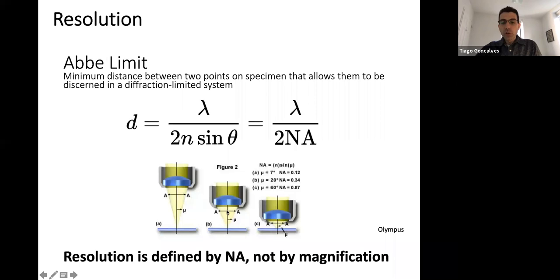And the numerical aperture is a measure of the catchment angle of your objective, how much light it actually captures. If you imagine a single GFP molecule in space, it will emit photons in every direction along a sphere. The numerical aperture captures how much of the sphere surface is captured by the objective. How much of that goes into your microscope? Because your GFP molecule is emitting everywhere.